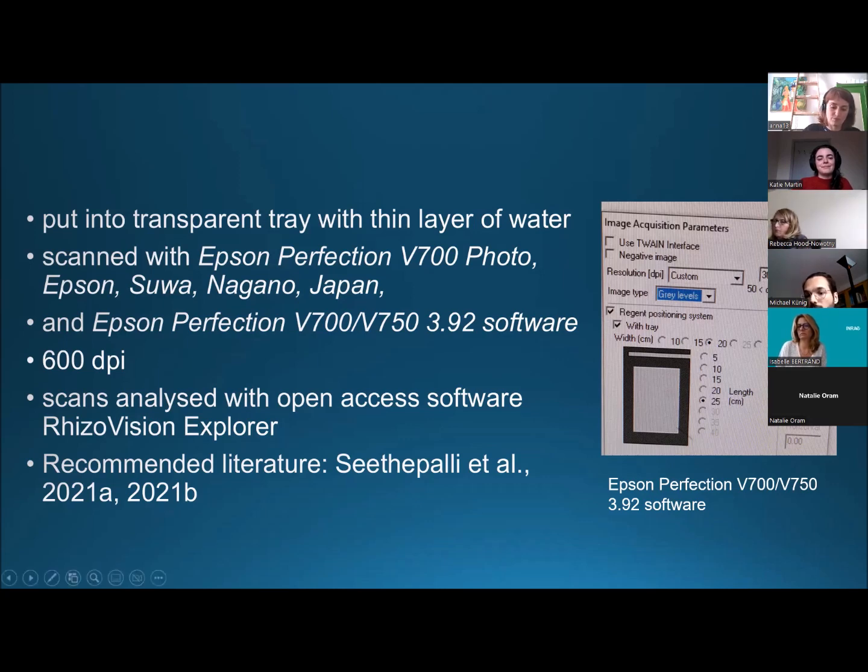This is the software from the scanner. This is nothing difficult, and with 300 the quality is, in my opinion, not good enough. Over 600, of course, the quality improves, but it takes a lot more time. I think 600 is in many cases enough, but this depends on the research questions.